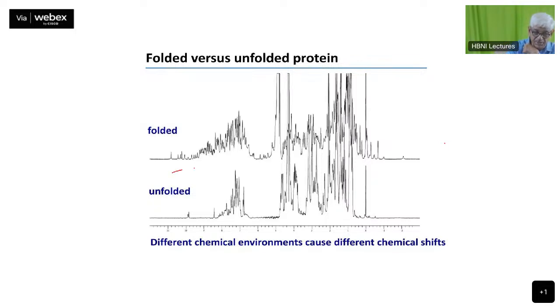This is the NH region here. This is the amide proton region here. And this is the C alpha region. And all the other stuff is the aliphatic region here. All the methyls and methylenes and all of those things will appear in this area. So these are the NHs and the NH2s. Exchangeable protons appear in this area, at least the downfield areas.